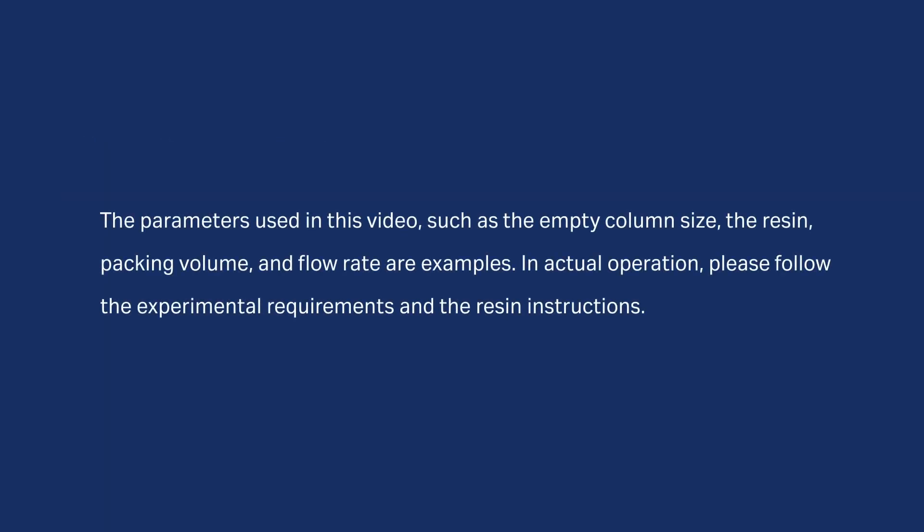The parameters used in this video, such as the size of the Tricorn chromatography column, type of chromatography resin, packing volume, and flow rate, are examples.